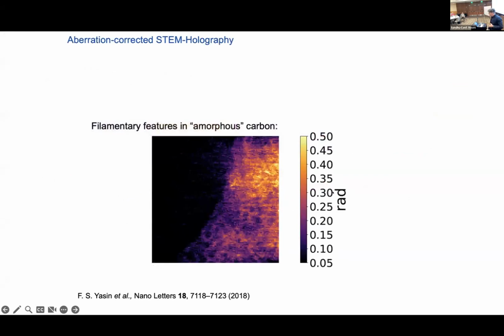And in fact, if we only image the carbon with our electron interferometer, we can see features in here. There are some stringy features, and sometimes there are rings. So it's not actually amorphous; it's these carbon chains that are forming. There's some theory. Believe it or not, there are papers written on amorphous carbon: what is the structure of amorphous carbon? It's consistent with that.